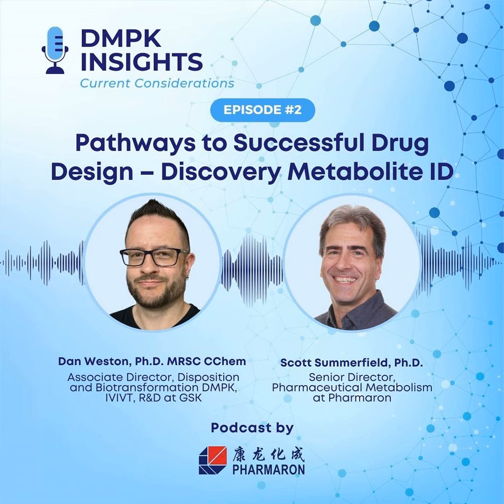So it's really looking at what we did beforehand to support discovery in an ad hoc way, and then looking at how we might streamline that support to make it more relevant, to make it eventually scalable in terms of being able to meet higher compound numbers, but really looking at removing a lot of the pinch points where there's a lot of manual intervention or time where we're not actually answering the question, we're just being, let's say, inefficient with our time or in the way that we use that biotransformation expertise. We're looking to get to a first set of rationalized data as quick as possible.